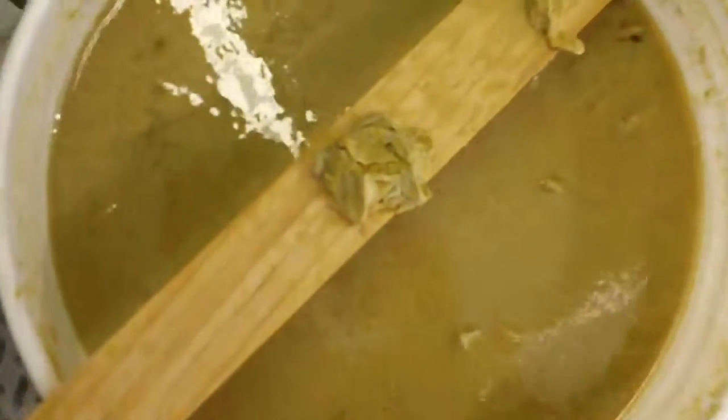Interesting material. It looks like there's some filter paper or something that's inside of it, but it looks like the real separation they're going to want to make is of those smaller particles. Our best shot at it is probably going to be with our CP4 screw press, which is what we have here, one set up in the lab area.